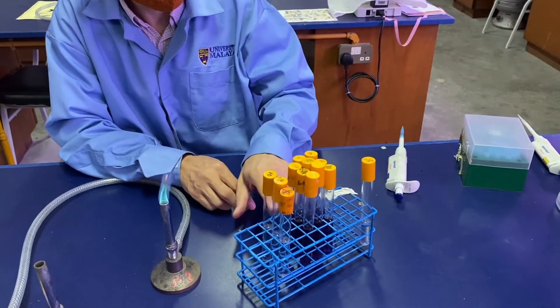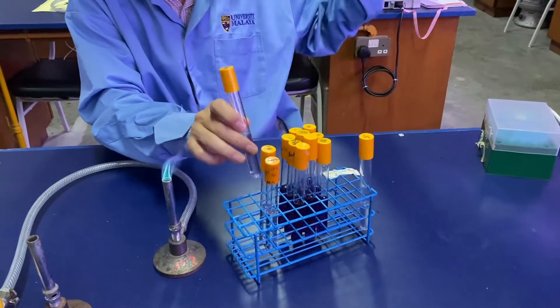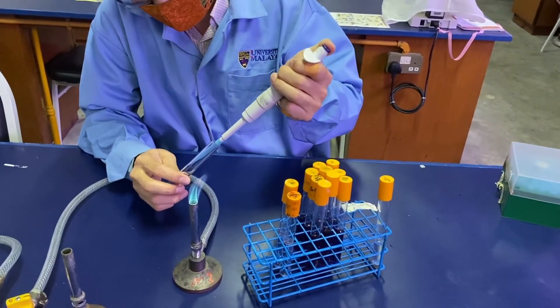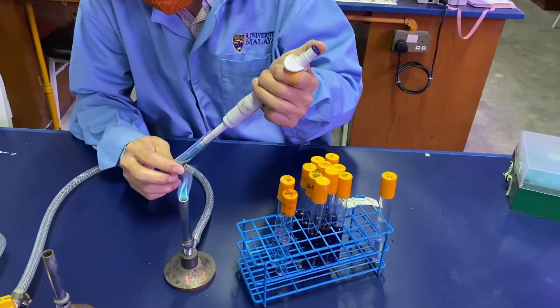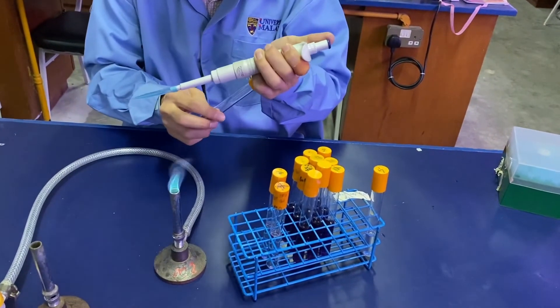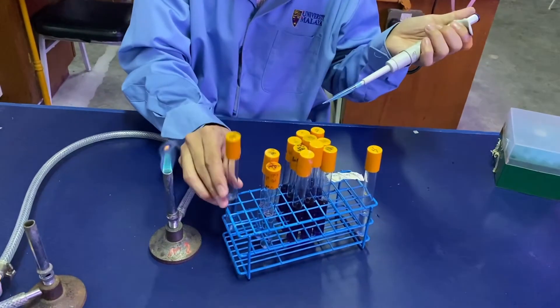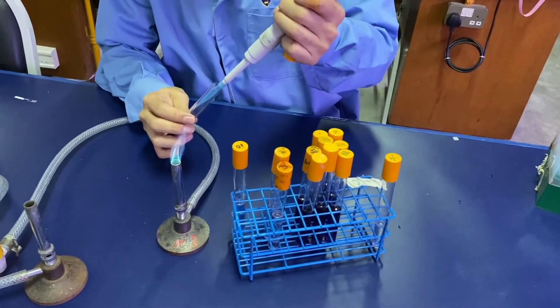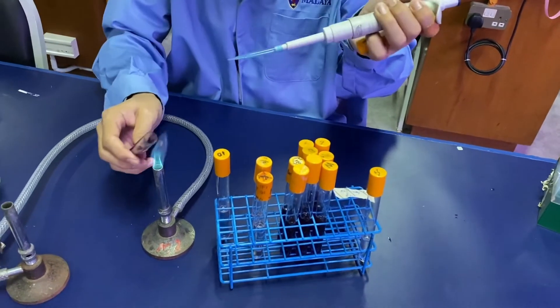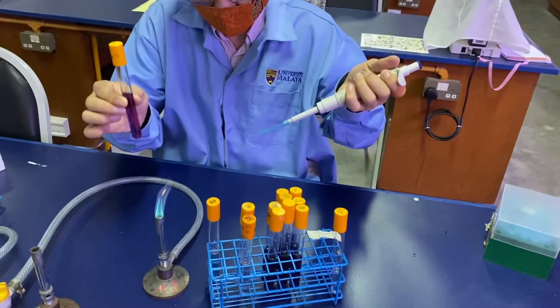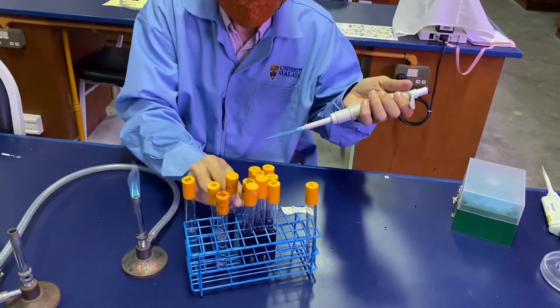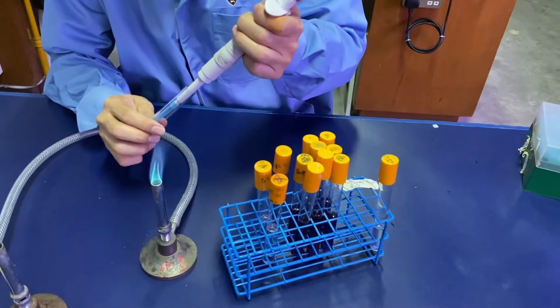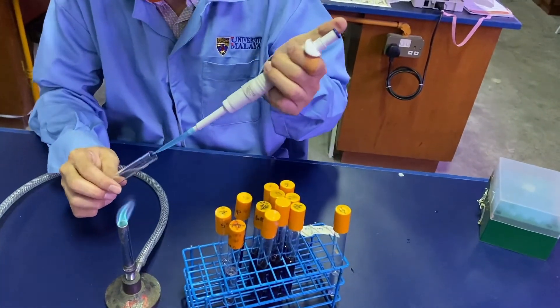Into the MPN tubes. Usually I will start with the one with the highest dilution, which is minus three. This is to minimize crossover contamination, so from minus three to minus two to minus one.